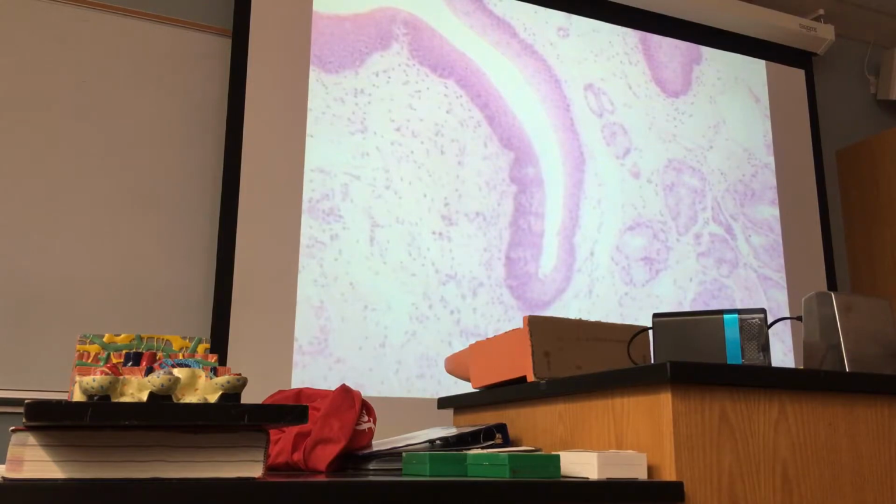And in the tongue, you can have only the glands that are located in the tongue. These glands are called salivary glands? Not salivary glands. These are called lingual glands. Salivary glands are different. Sublingual gland.